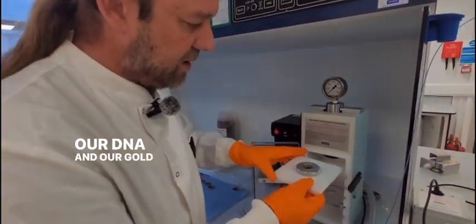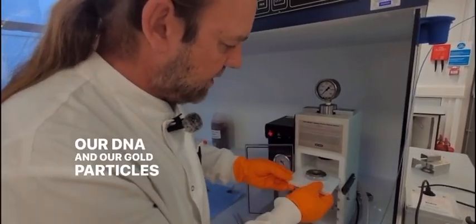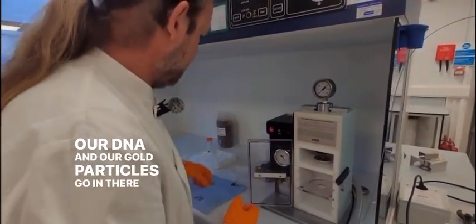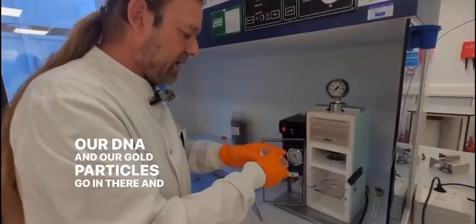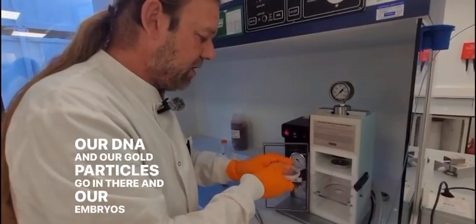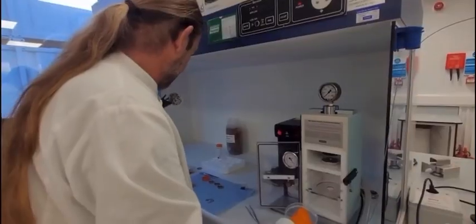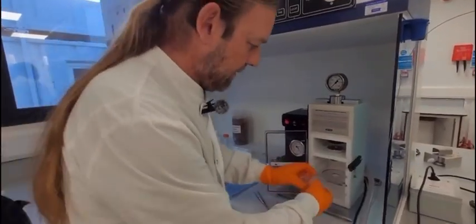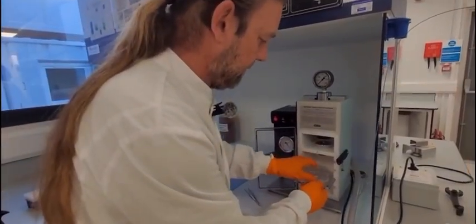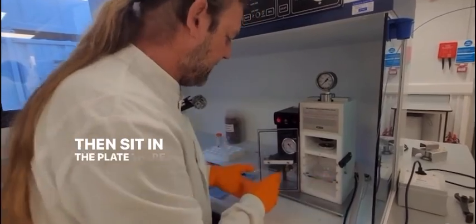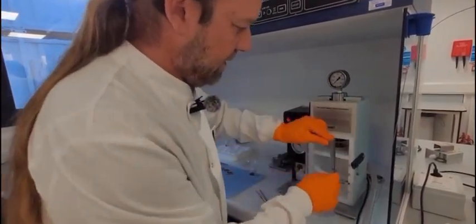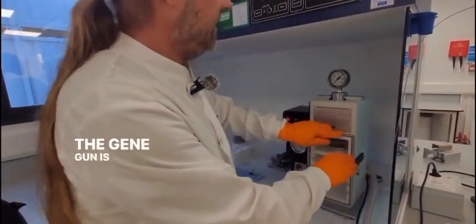Our DNA and our gold particles go in there and our embryos sit in the plate there. Gene gun's then closed.